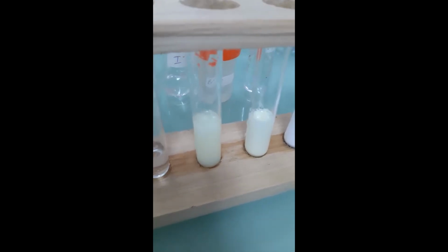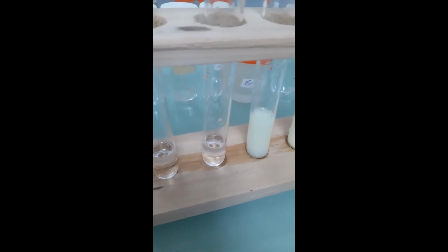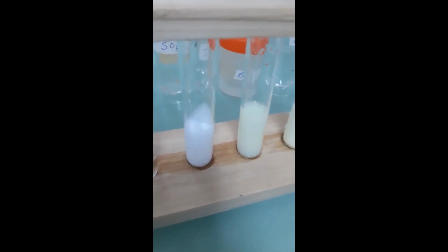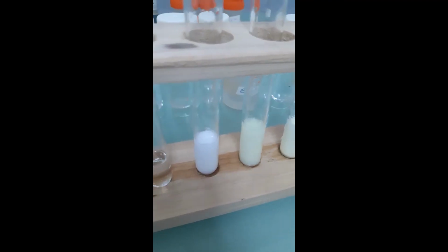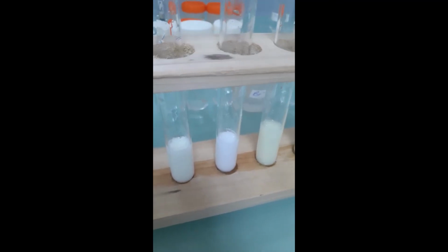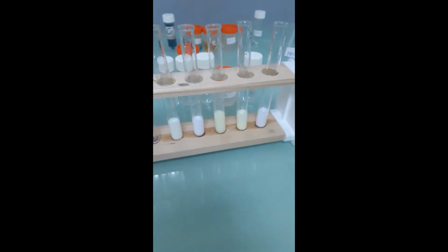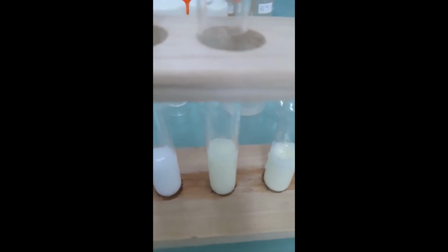Iodide. Sulfite. And carbonate. Those are your precipitates with silver nitrate. So we have from the top chloride, bromide, iodide, sulfite, and carbonate. Take your observations.